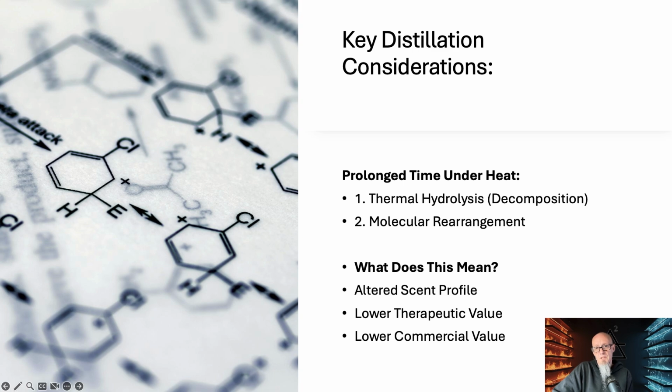Okay. Acid accumulation is another one. As the distillation starts, small amounts of acetic acid are naturally released from the plant, and this lowers the pH of the water. Okay, and so as you're distilling, when you get done, you're going to have to check your pH 100% just to make sure that you are in the range that you want to be in.